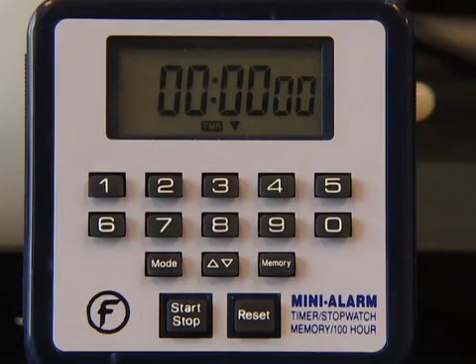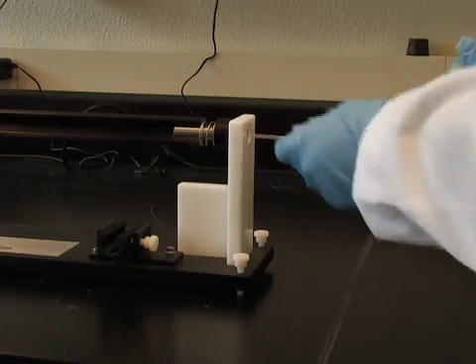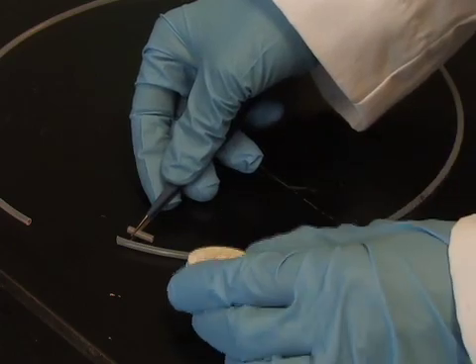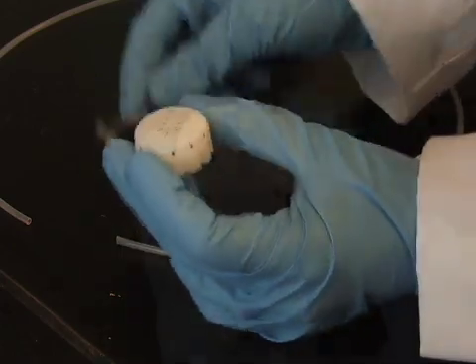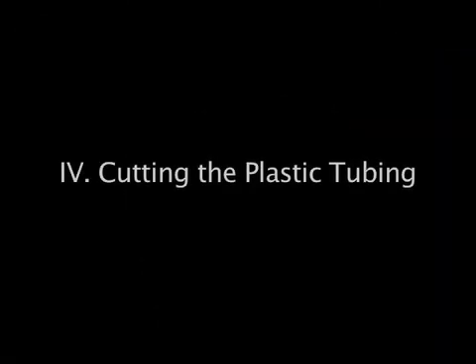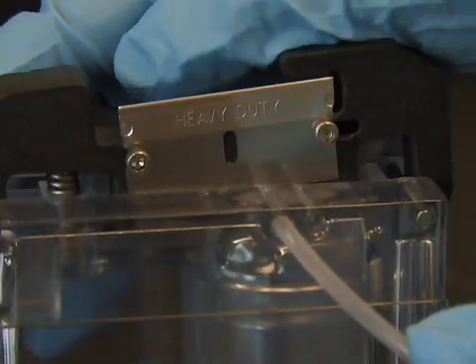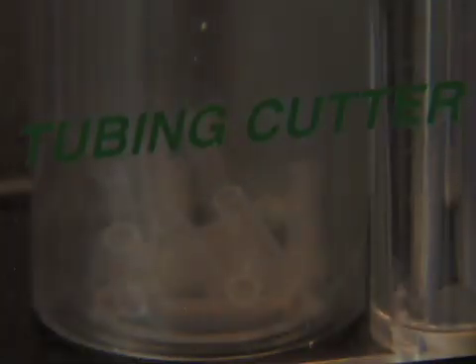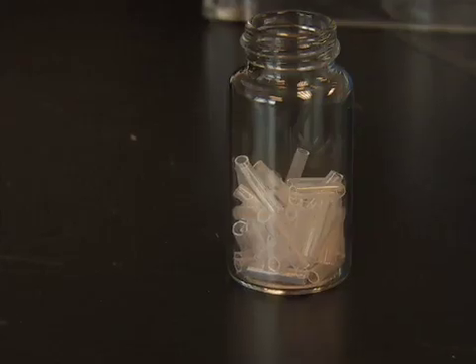Now that the 5 minutes are up and our gold is dry, we need to cut the tubing into cartridges that can be loaded into the gene gun. Now I will cut the tubing into about a half inch sections to make the shells that will be an appropriate size to load into the cylinder of the gene gun.